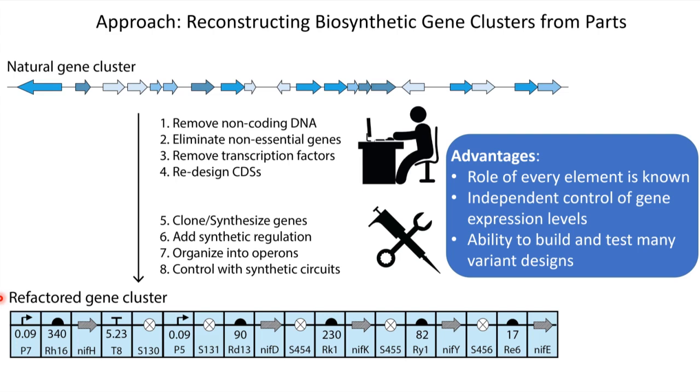Those redesigned coding sequences will be synthesized using a DNA synthesis vendor. And then the synthesized genes will be reassembled into a functional gene cluster by adding back in well-characterized regulatory elements in the form of promoter sequences or designed ribosome binding sites, until in the end we have a fully synthetic refactored gene cluster.